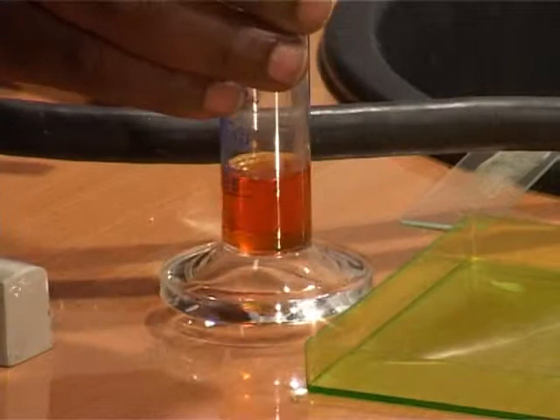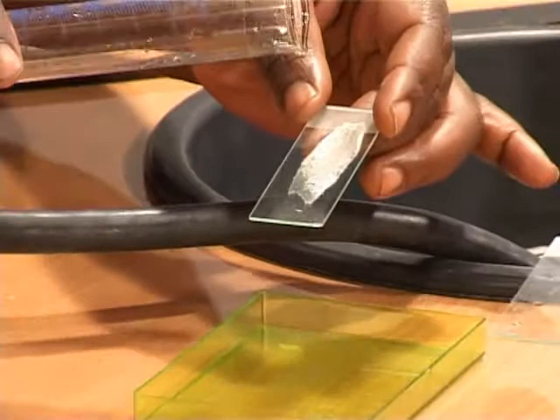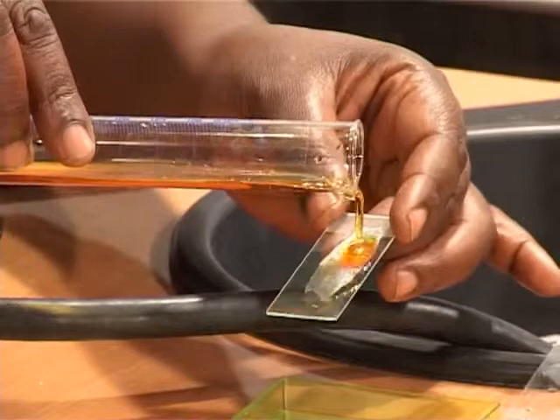Now, learners, if you want to see the cells clearly, including the nucleus, there is a chemical that we use, which we call the iodine solution. This is iodine solution. Okay, let us put it on our specimen. You just have to add a drop, just a drop like that.